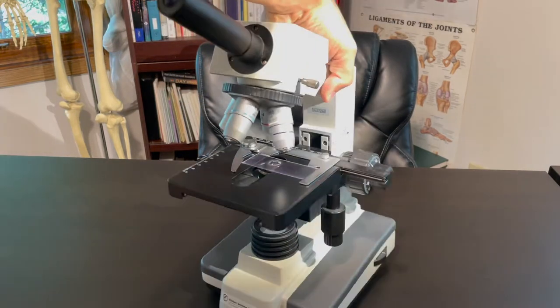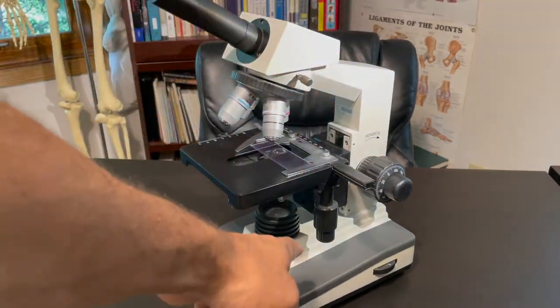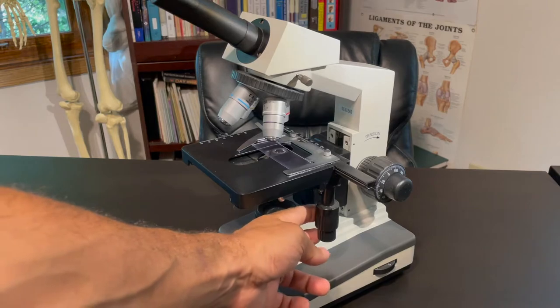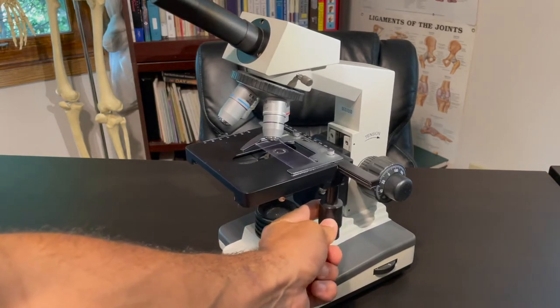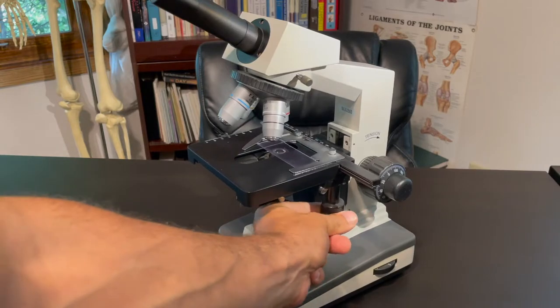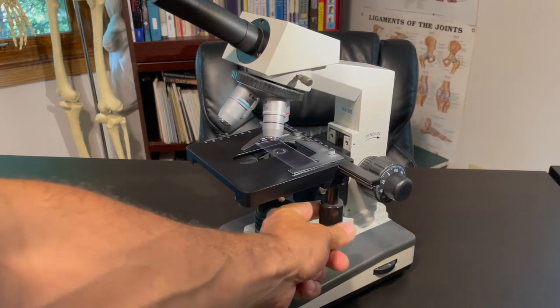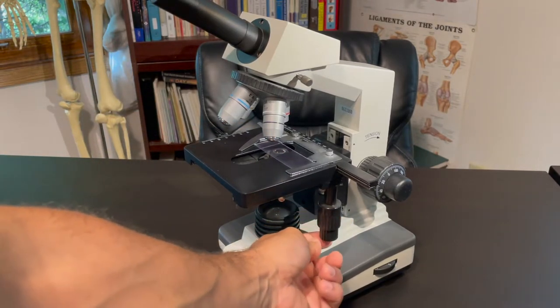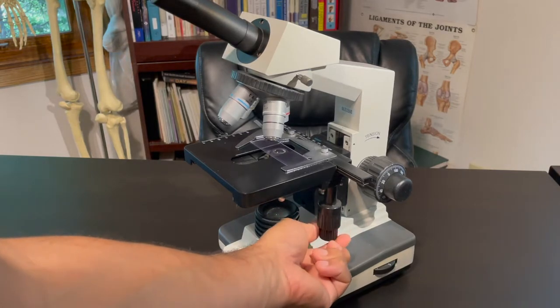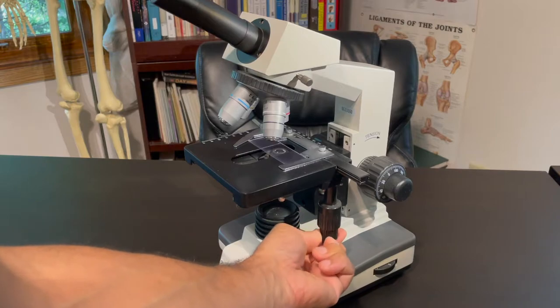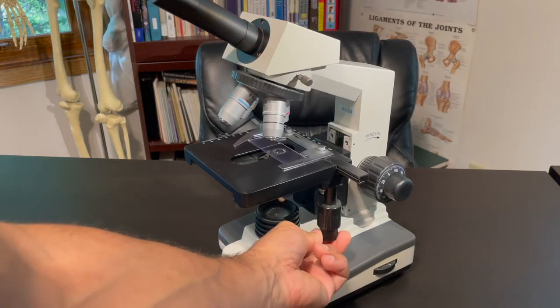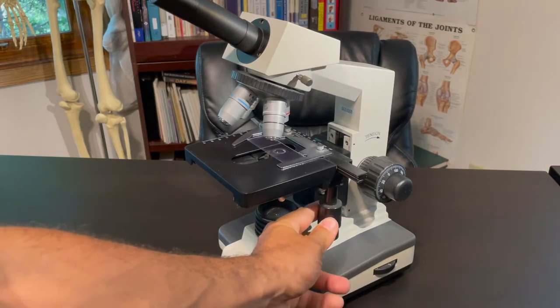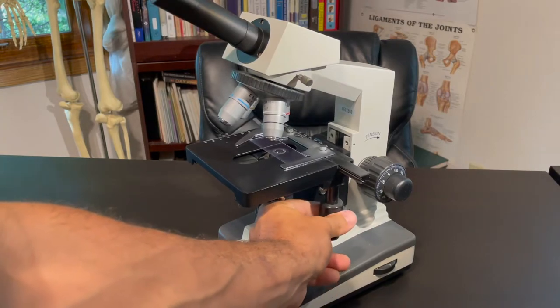And if we spin this around, these are also important. You have two knobs right here. And these are your mechanical stage control knobs. The top one here will move the stage forward and backward. And what that does is allow you to see different parts of your specimen, forward and backward. And the second one moves just the stage clip, which moves your slide back and forth. And that moves the specimen left to right, left and right. And by doing that, you can see all parts of your specimen.